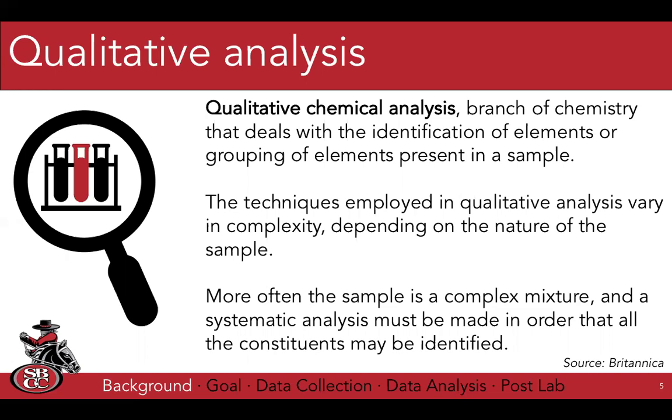of examining a sample in which you, the viewer, the scientist, is the sensor. As soon as we begin to use electronic sensors, we tend to calibrate those things, and they very quickly become quantitative analysis. How bright the sample is coming into the sensor, we can associate maybe with concentration. We learned that last week with Beer's law, right?